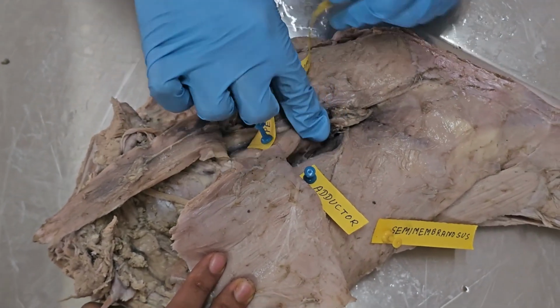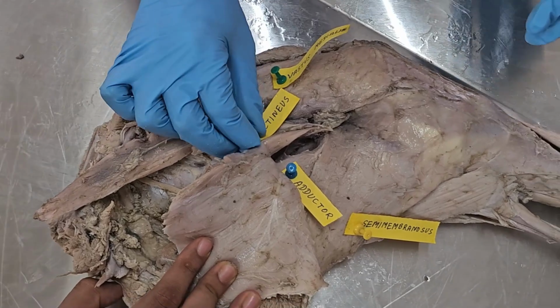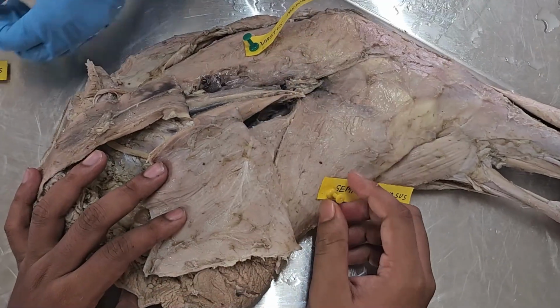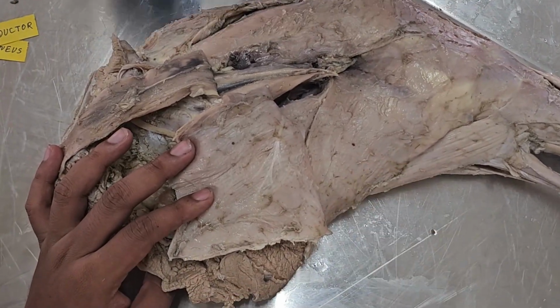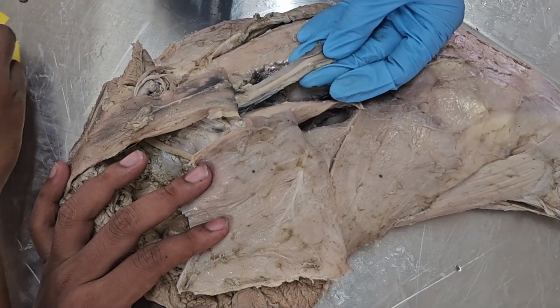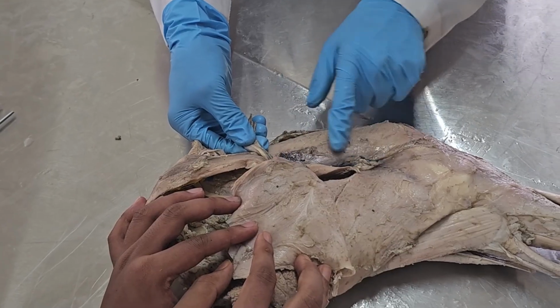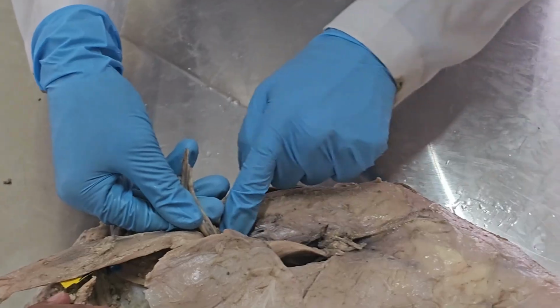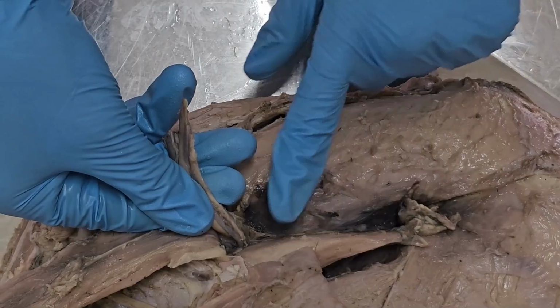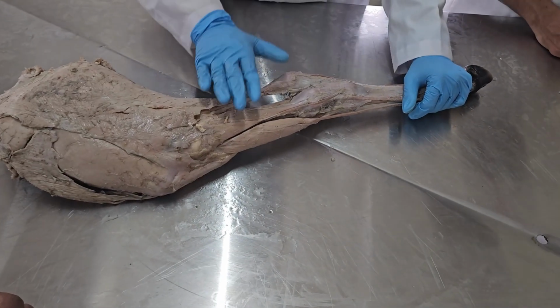So now you can see the canal. I am removing the muscle flesh now to see the canal properly. These are the blood vessels and nerve fibers we will discuss. So now you can see, this canal is called the femoral canal. Now we will discuss the muscles of the lateral aspect of the leg region.